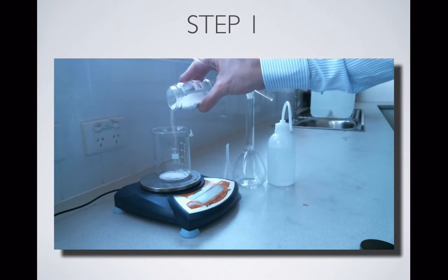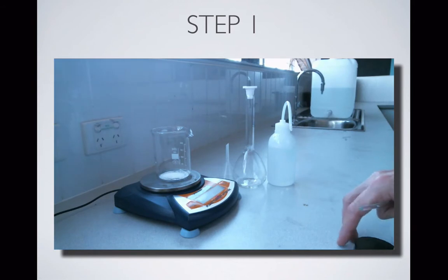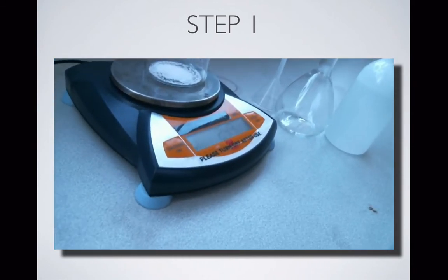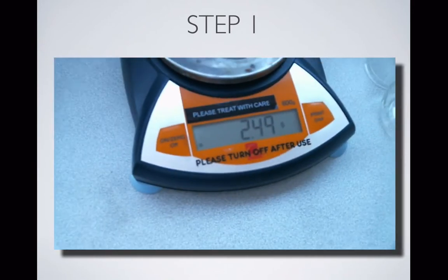What I am going to make sure of is that I know the mass that I've taken exactly. That's what weighing something out accurately is about. It's not about taking an exact amount, it's about knowing exactly what amount you're taking. So if we have a look at how much I've weighed out, I took 2.49 grams.